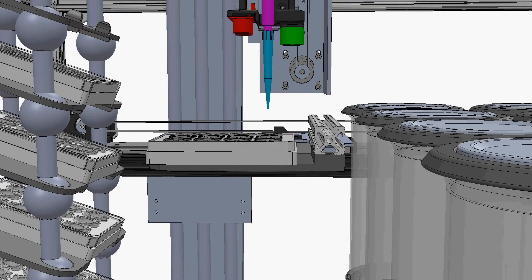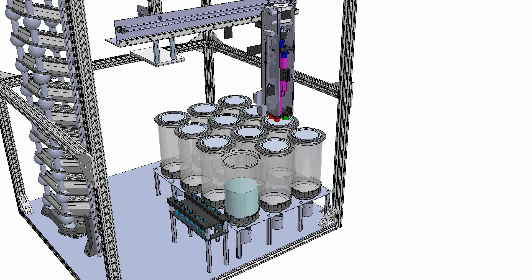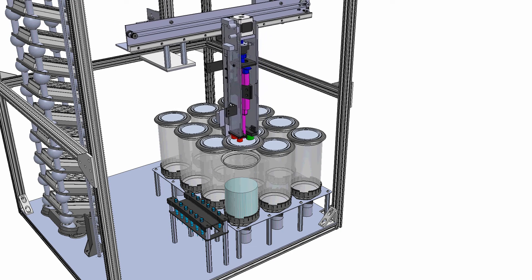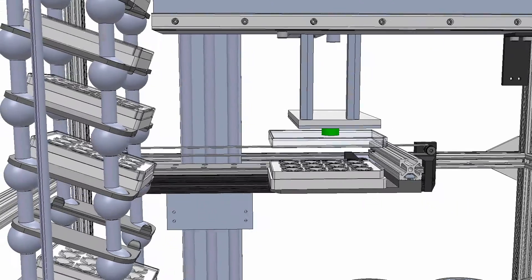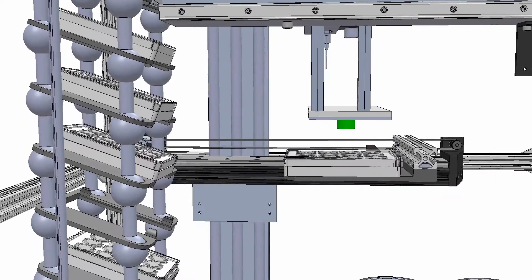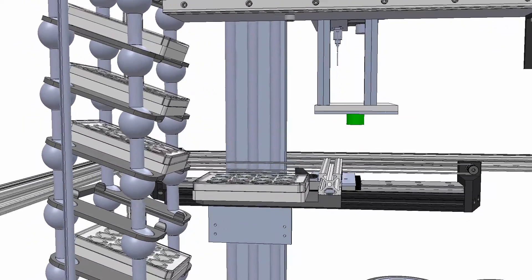The pipette is dynamically programmable and accurate to 10 microliters. The beaker lid is replaced. After all 12 of the wells are processed, the well plate is placed back in the nutating tower and the cycle repeats.